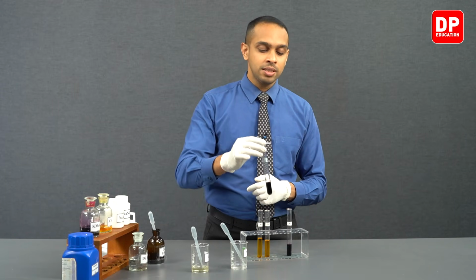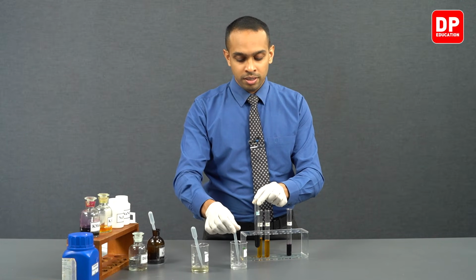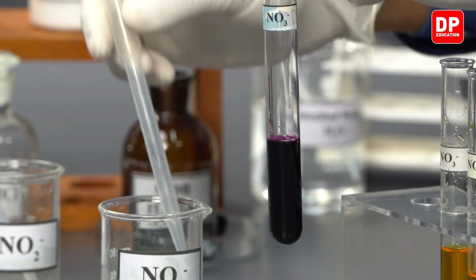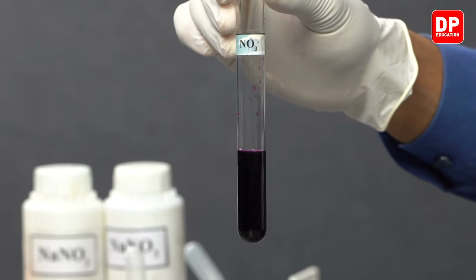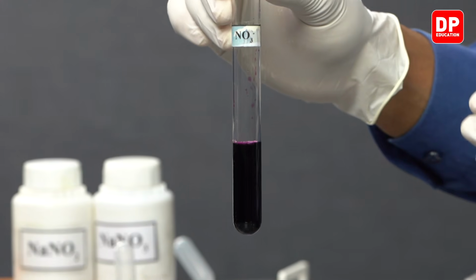Now, let's take acidified potassium permanganate and add to it a small amount of nitrate ions solution. Do you observe a color change? The answer would be no. In the presence of an oxidizing agent such as acidified potassium permanganate, nitrate ions can't get further oxidized. So therefore, you will not observe a color change as you normally would when it comes to acidified potassium permanganate.